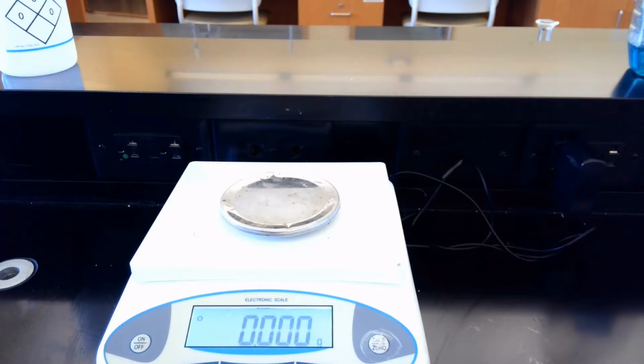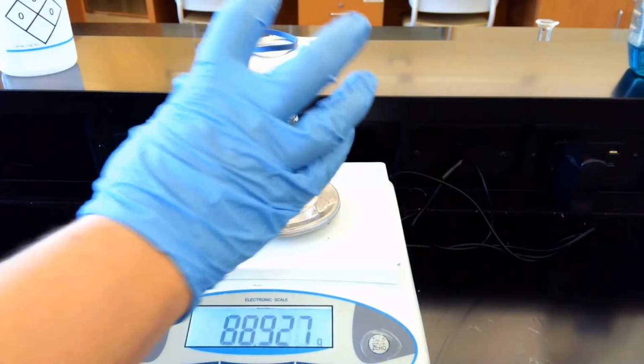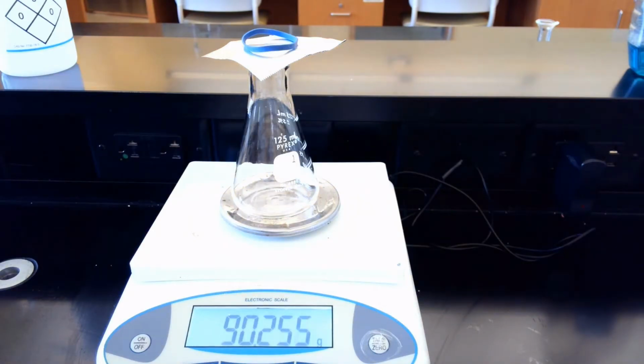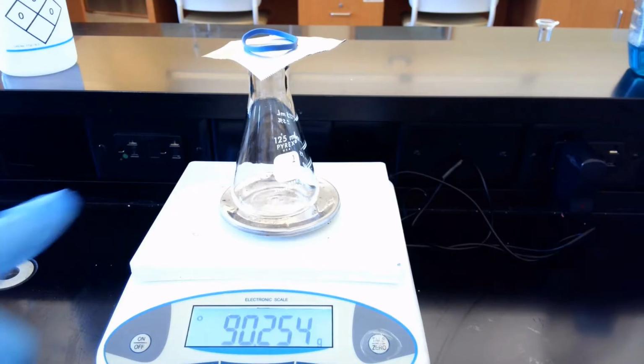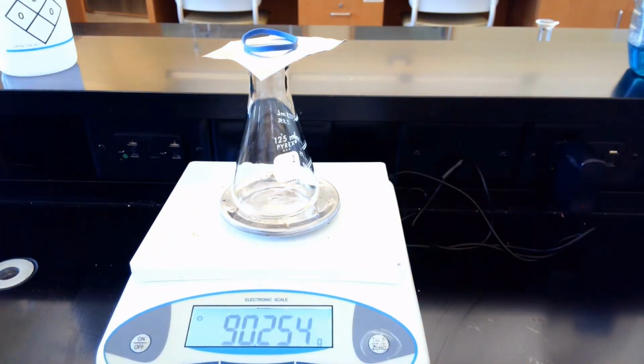We're going to get the mass of the flask, the aluminum foil, and the rubber band to secure it with. And our mass is 90.254 grams. And that is for the Erlenmeyer flask, the aluminum foil, and the rubber band that we're going to use to secure it all together.